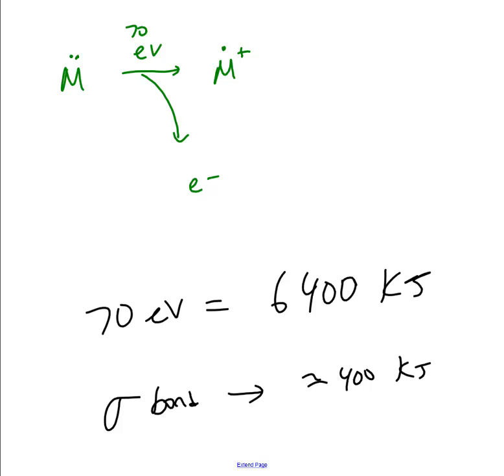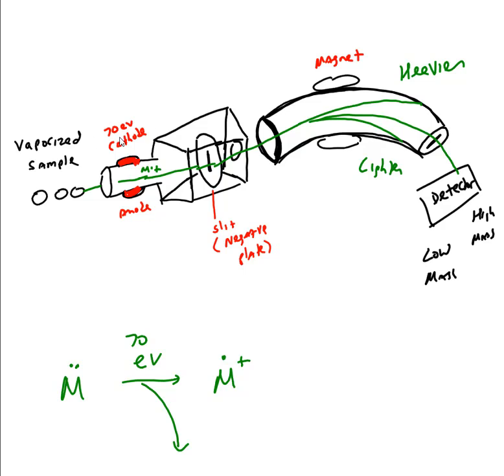So think about the collision here. This is a very, very high energy electron. When it hits this molecule, it's going to collide with it and break it apart, and that causes a disruption within the system. As it flies through this path, it just breaks up and fragments into different things.